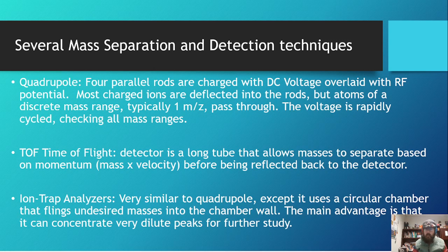to build up. And so if you get 10 of this key ion every second, well, we build this up for 100 seconds, and now we have thousands of these ions. And then you could then do further analysis. There's various techniques where you can run a mass spec on a mass spec. So you take out one specific fragment and then hit it again with another electron impact and see what happens. We hit it again and see how this fragment breaks up. And by seeing that, we can understand, oh, this fragment is actually made up of these molecules.